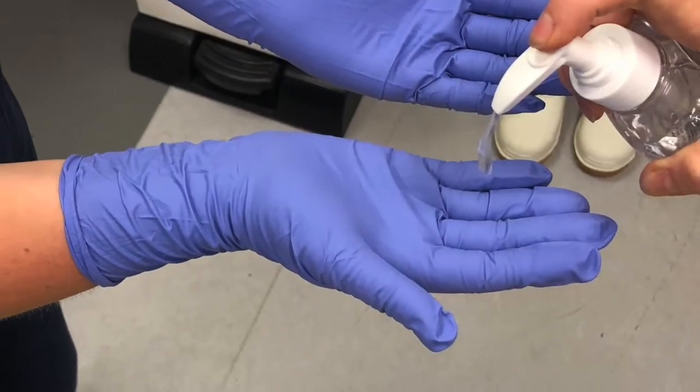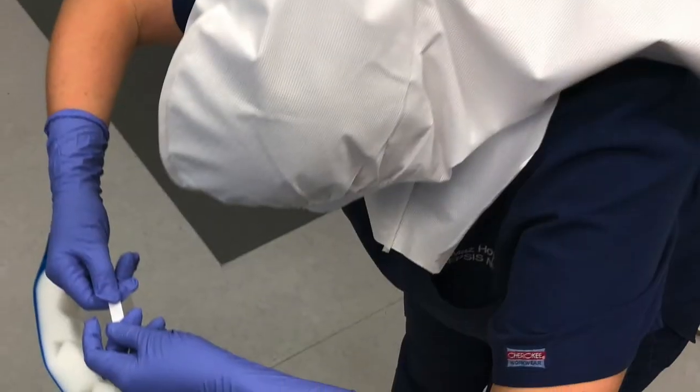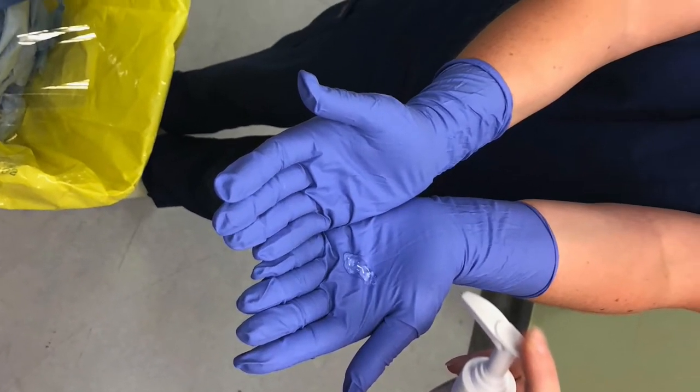Have your colleague put alcohol gel onto your gloves and rub in. Remove your face mask whilst leaning over the bin — lift and pull the mask away and down from you. Have your colleague put alcohol gel onto your gloves and rub in once again.